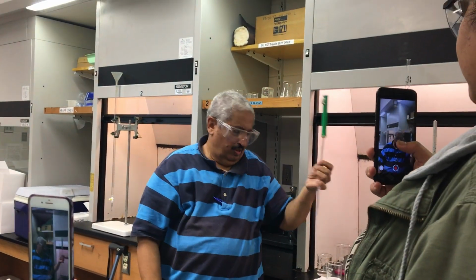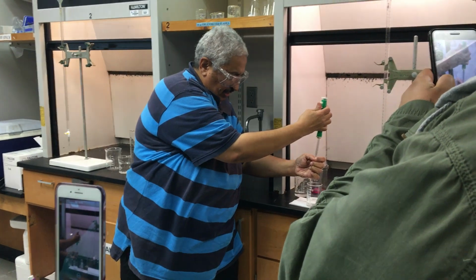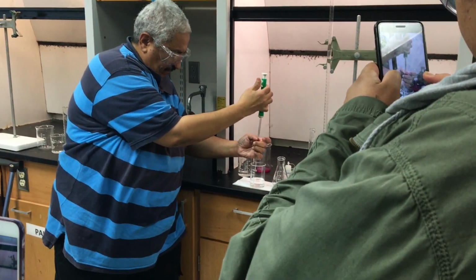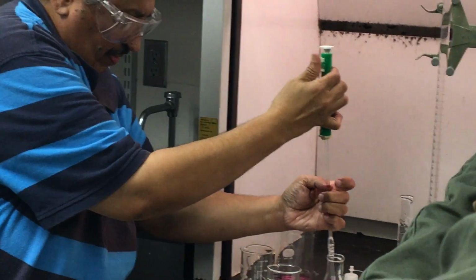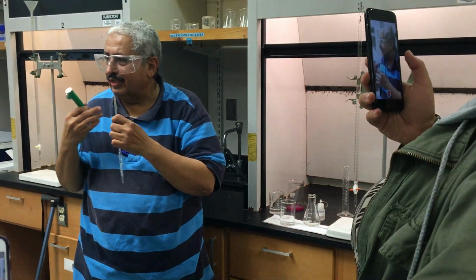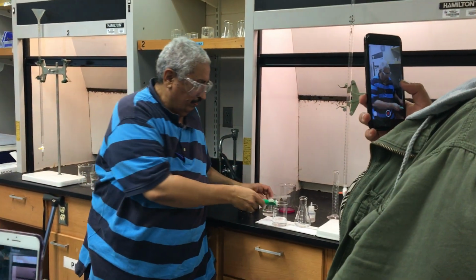So let's immerse this one here, not all the way touching the bottom. We'll turn the wheel here, up. See here? A little bit up, up, up, up. And then just leave the wheel here. Can I take it and blow with my mouth? Can I blow the rest with my mouth? No, that's part of the error, correct? So no blowing with the mouth. So just leave it there.